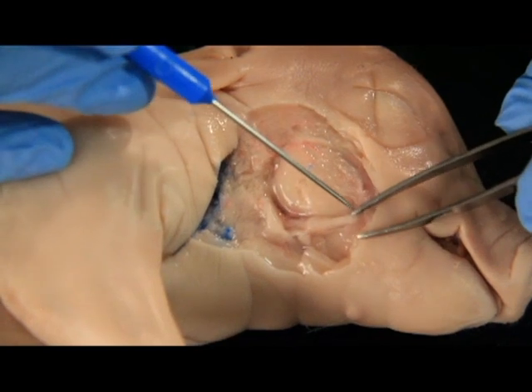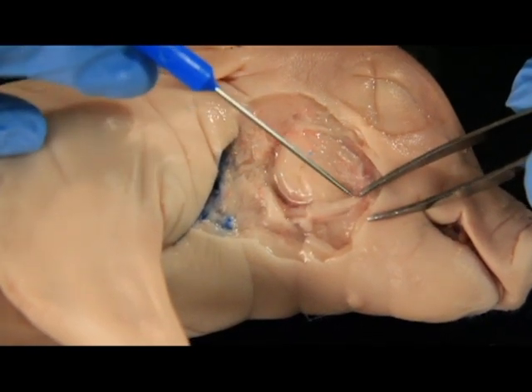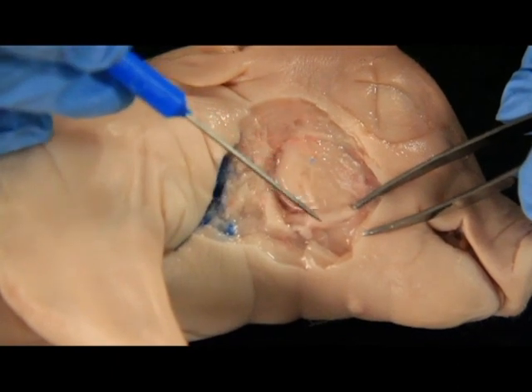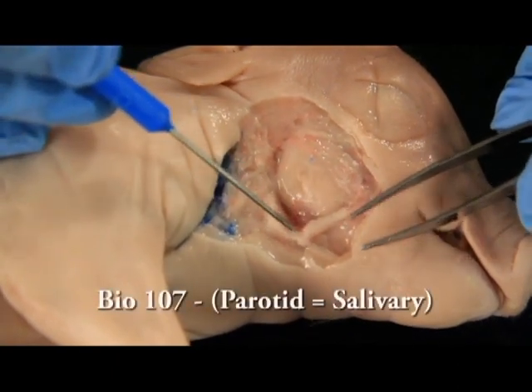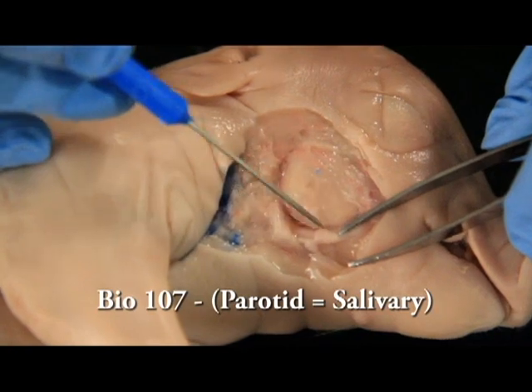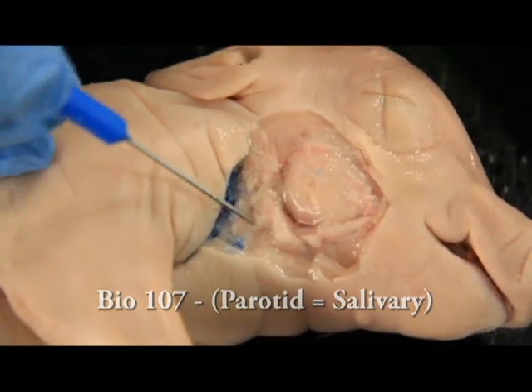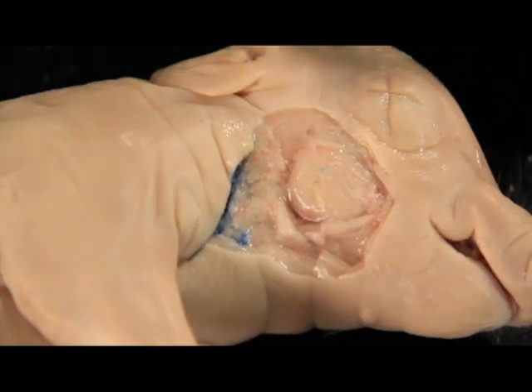So going below, and you can see this right here, this thin white line going below, leading into all this parotid, this is your parotid duct. And again, your parotid duct has all these arteries behind it. That's how you can usually tell. And that parotid duct will feed right into this parotid gland, all this fatty neck tissue.